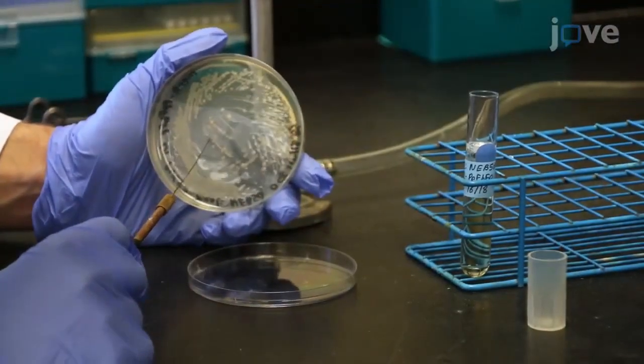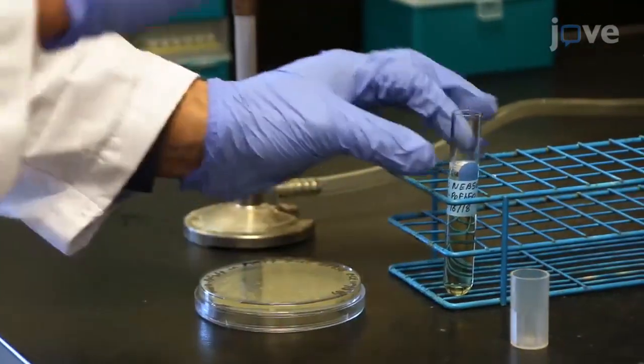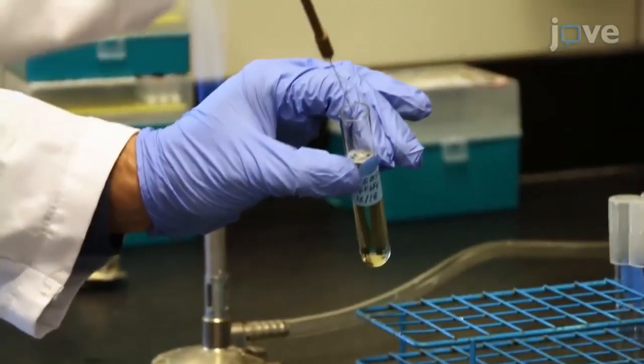Between 4:30 and 5 p.m., inoculate a culture in 10 milliliters of LB with ampicillin and grow overnight at 37 degrees Celsius with shaking at 220 RPM.